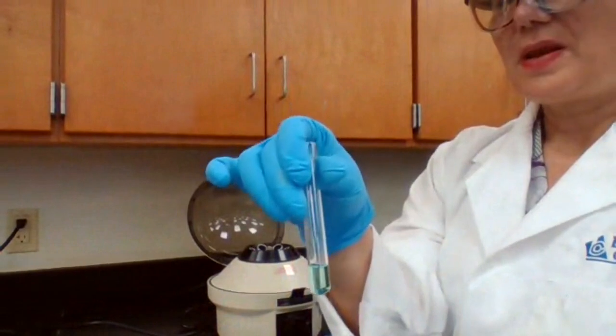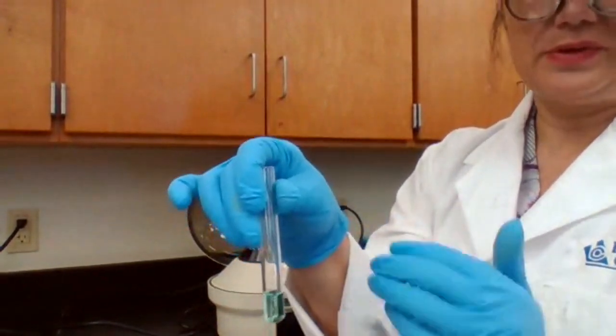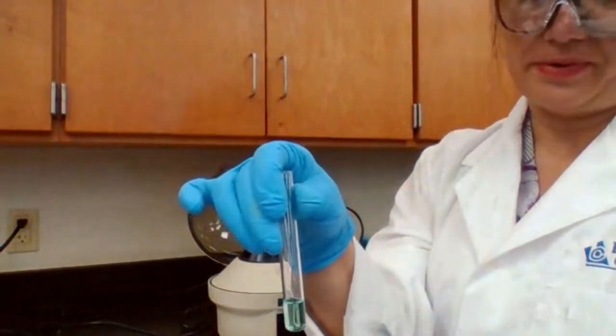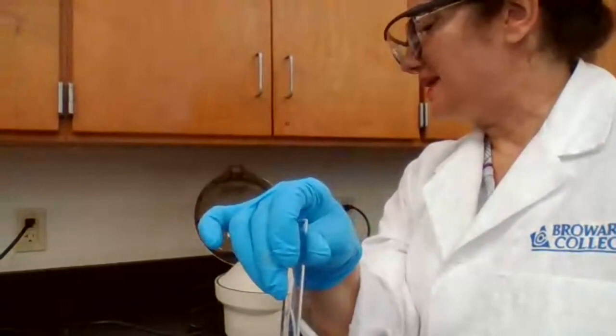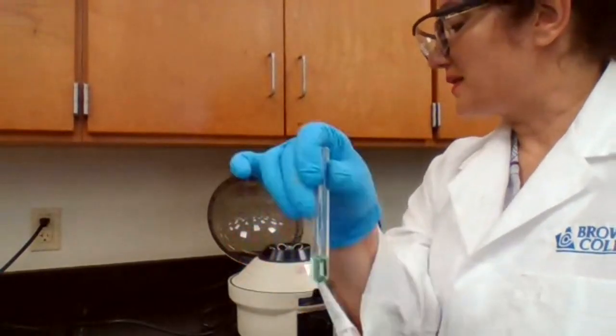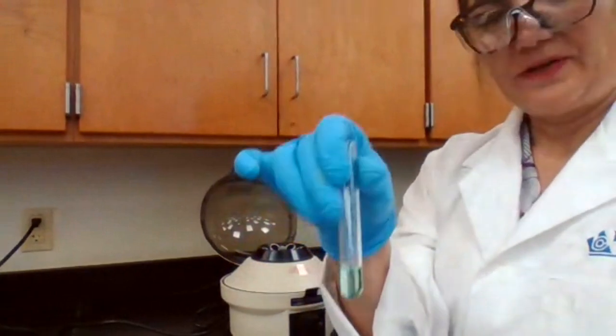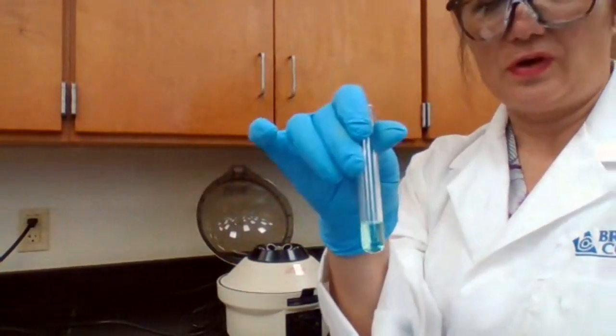If there is any lead, we have to remove it because it would interfere with the result of bismuth and copper. Removing lead is part 2A.